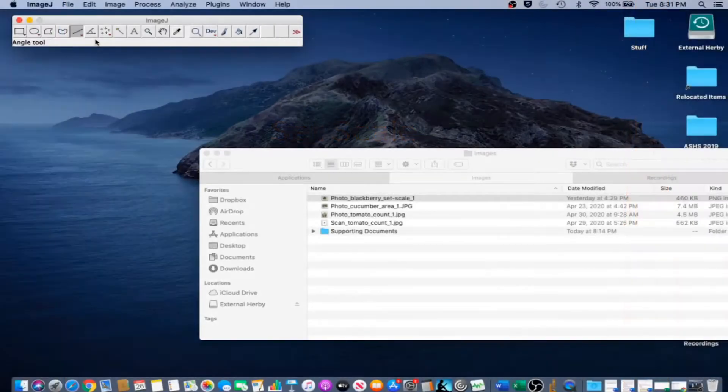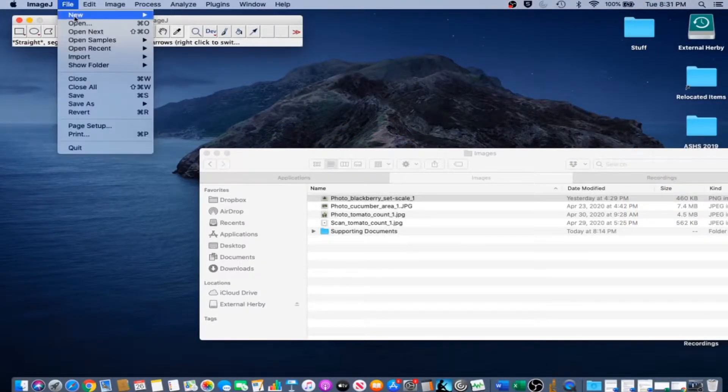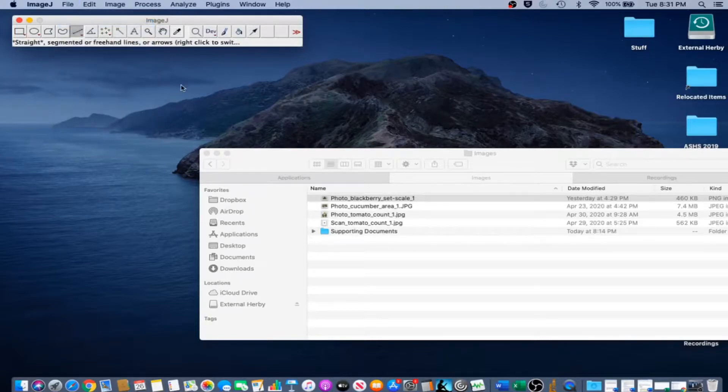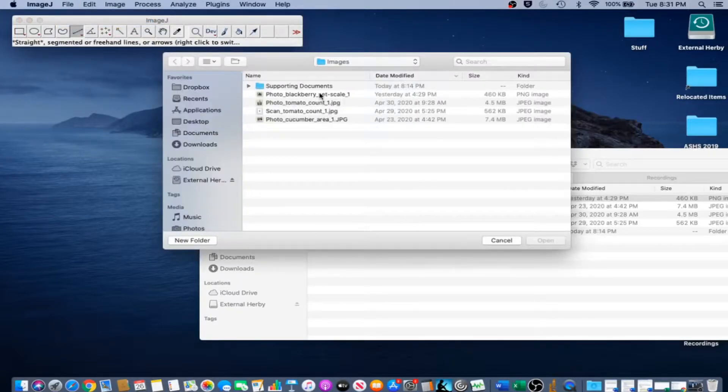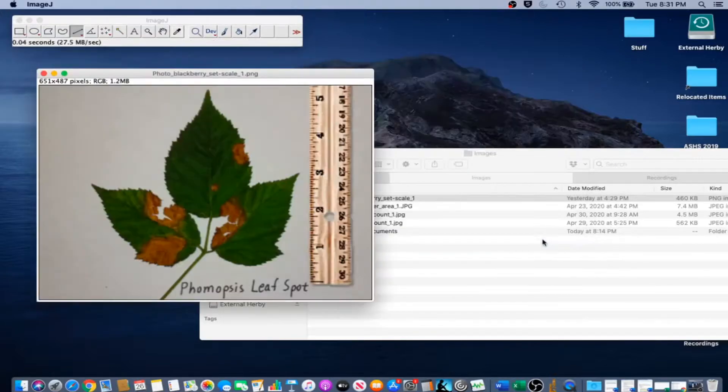In order to set scale for a photograph, first open the file. Go to File, Open, and navigate to where the file is located. Select the image and click Open.